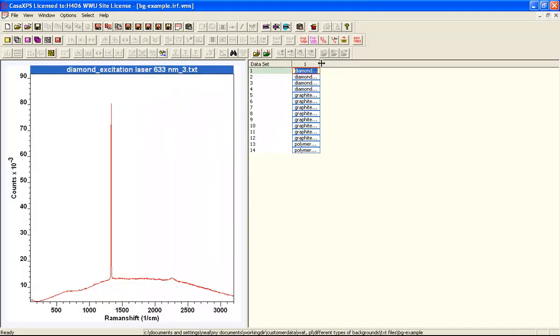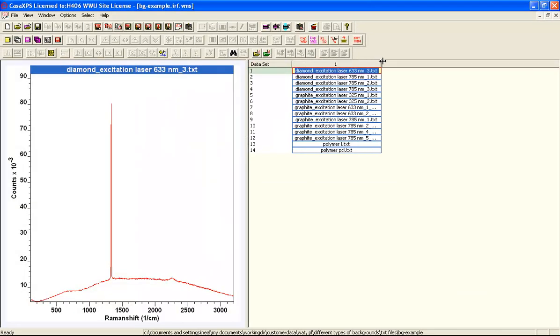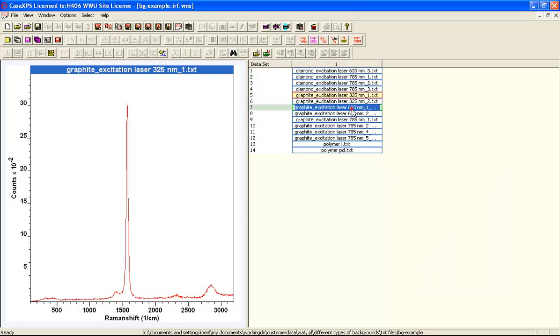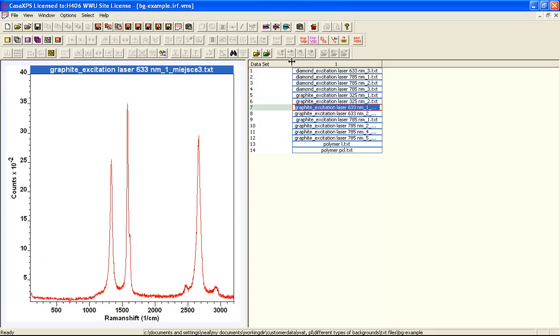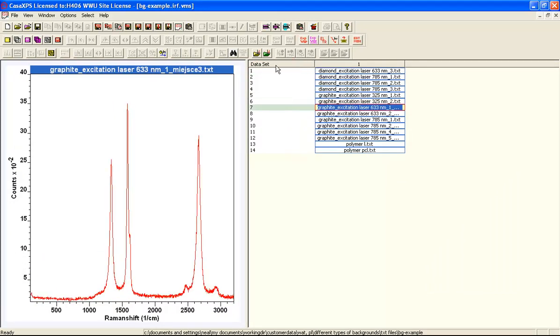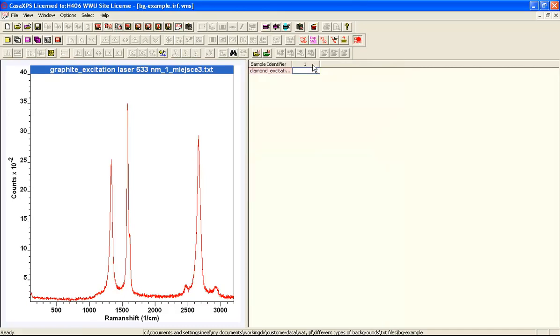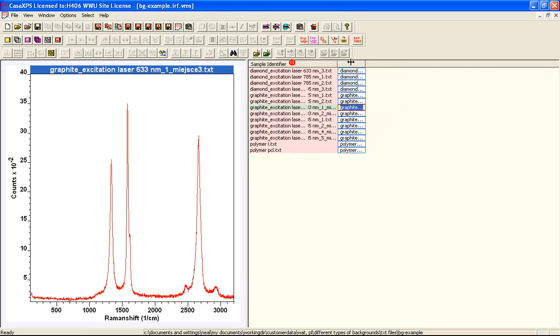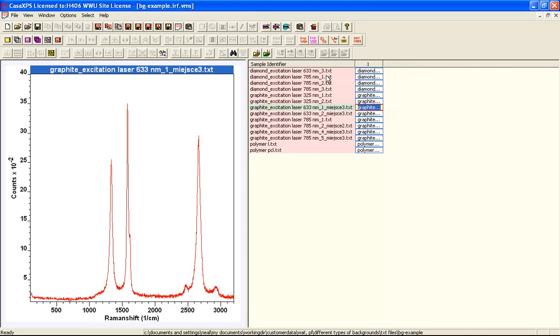So here we see the new VAMAS file. These are the VAMAS blocks containing the spectra. And each one is assigned a dataset index, and the sample identifier will similarly be set to the file name that was used to collect the data.